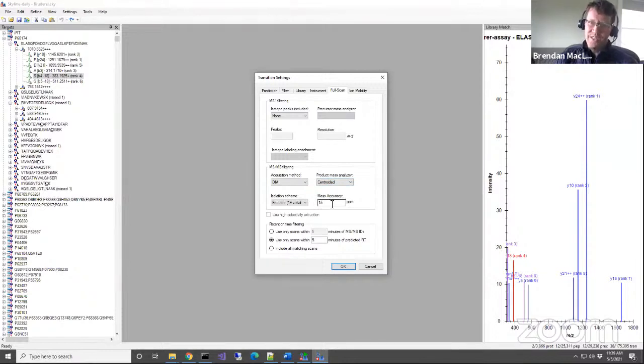It allows you to exclude a lot of stuff, and you'll get much better peak picking. We were worried it would have a negative impact on quantification, but it hasn't. If anything, it's a positive impact.